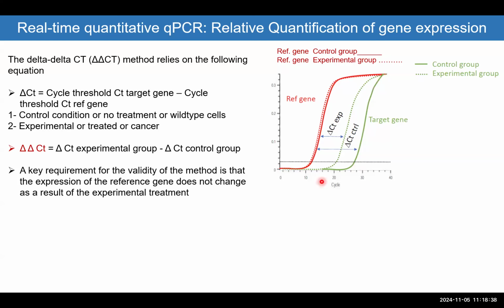Okay, so I can directly say that I have very good control genes in both conditions that didn't change, which is S16 or GAPDH. However, my experimental condition seems to be overexpressed or upregulated compared to the control condition.